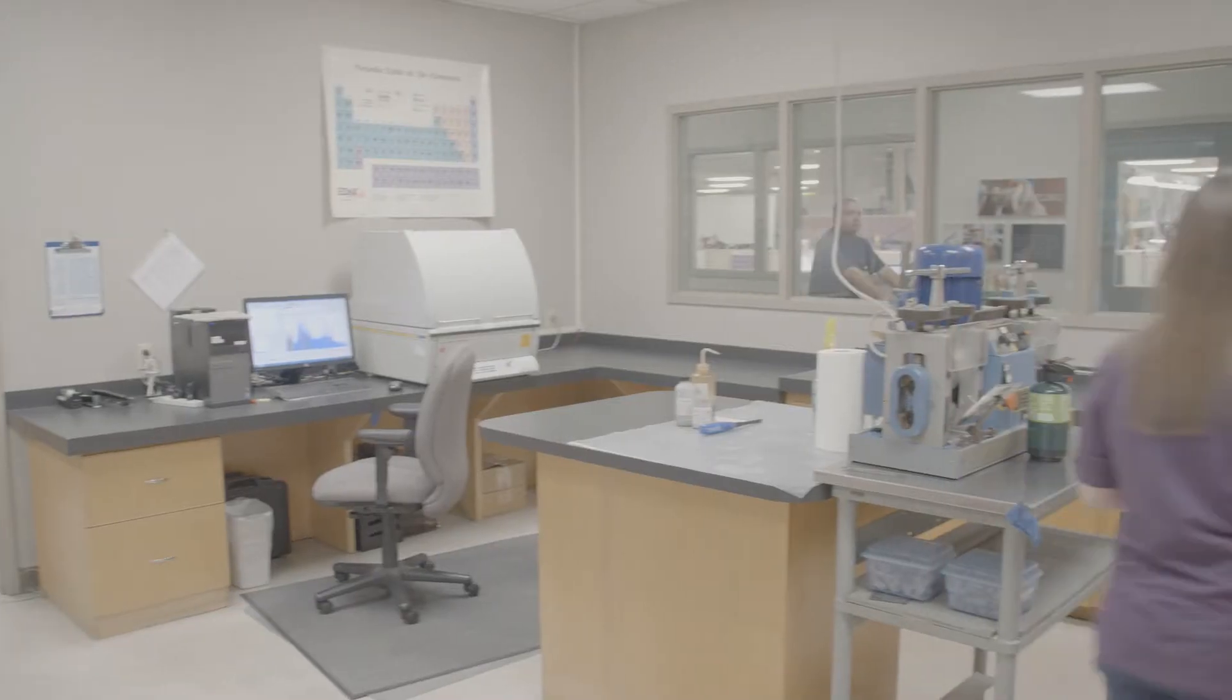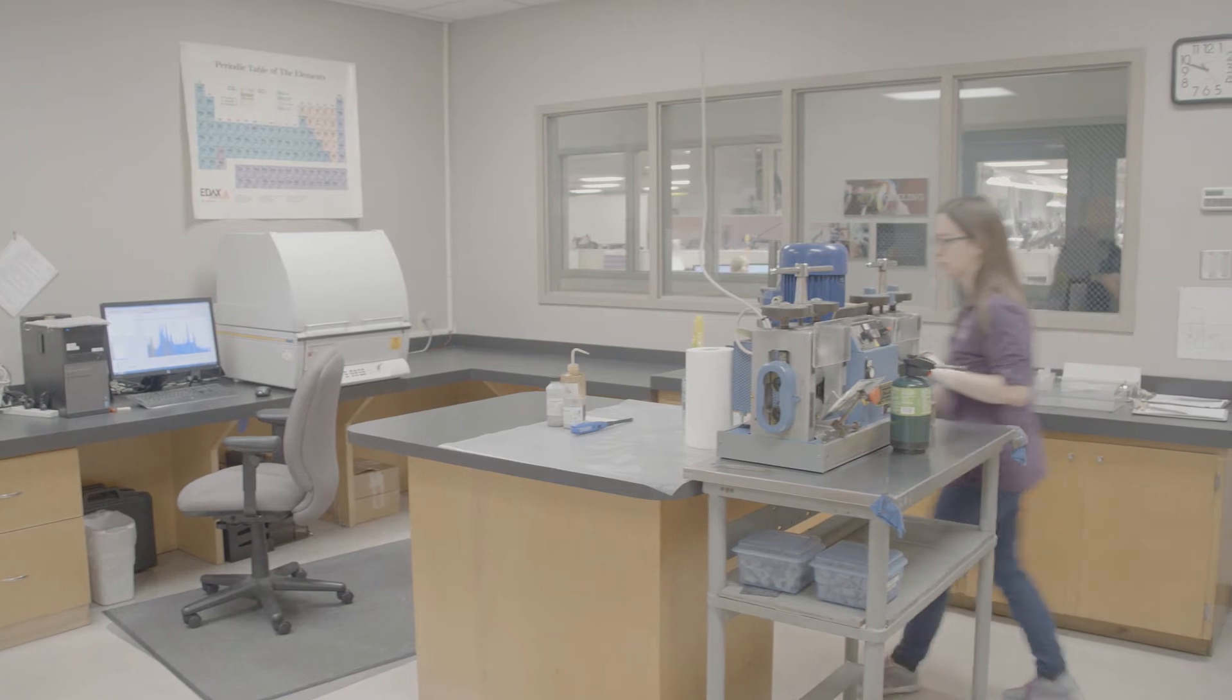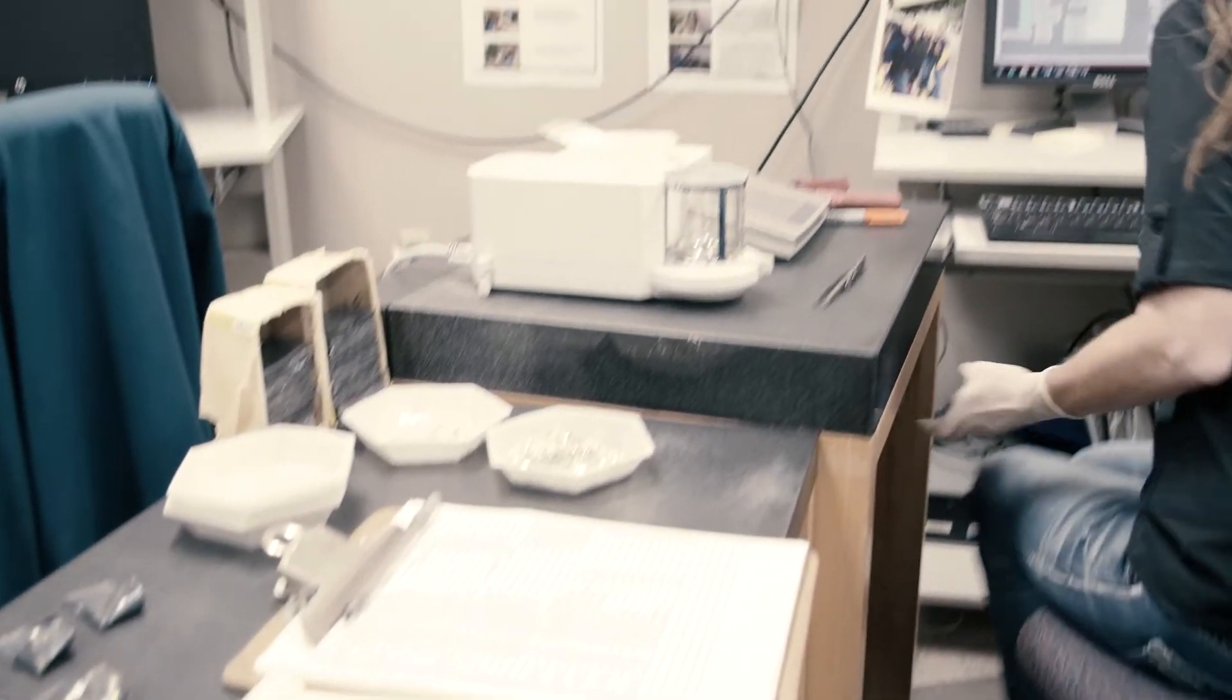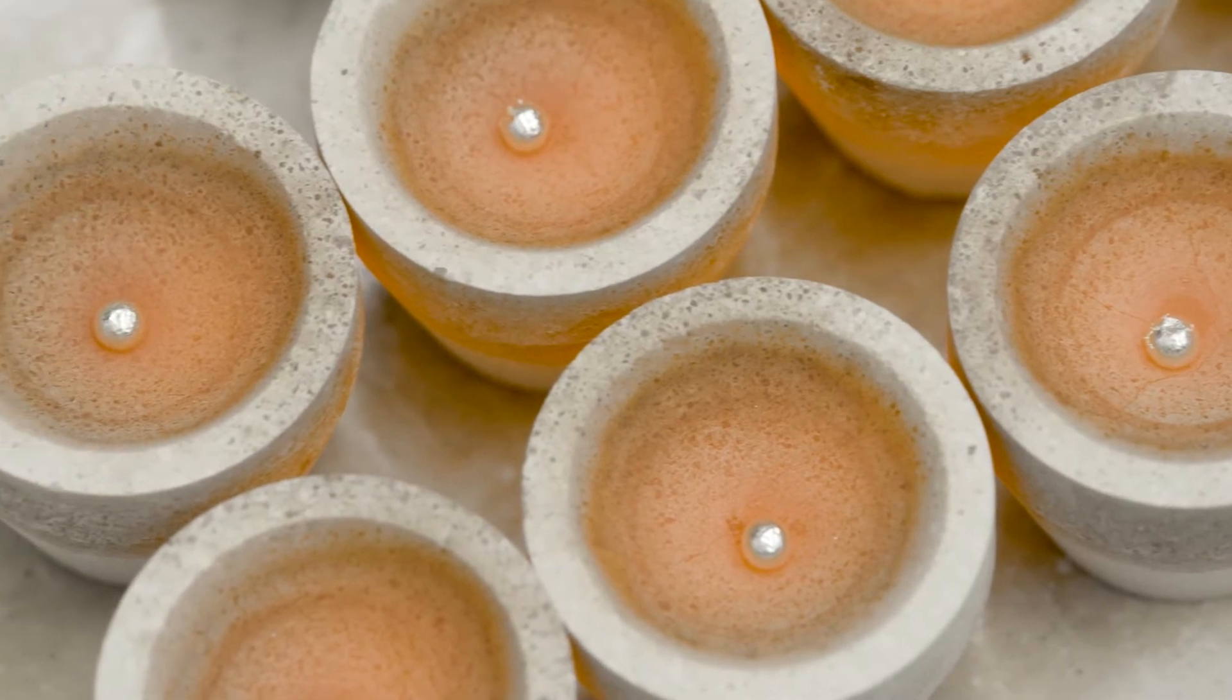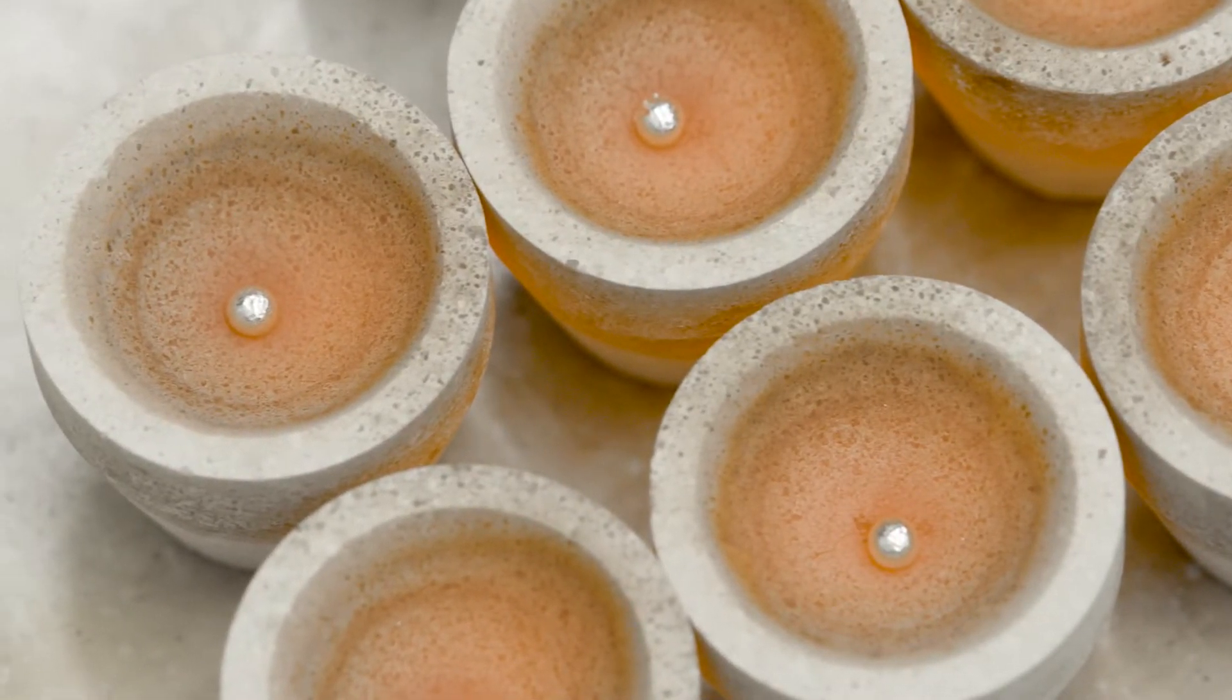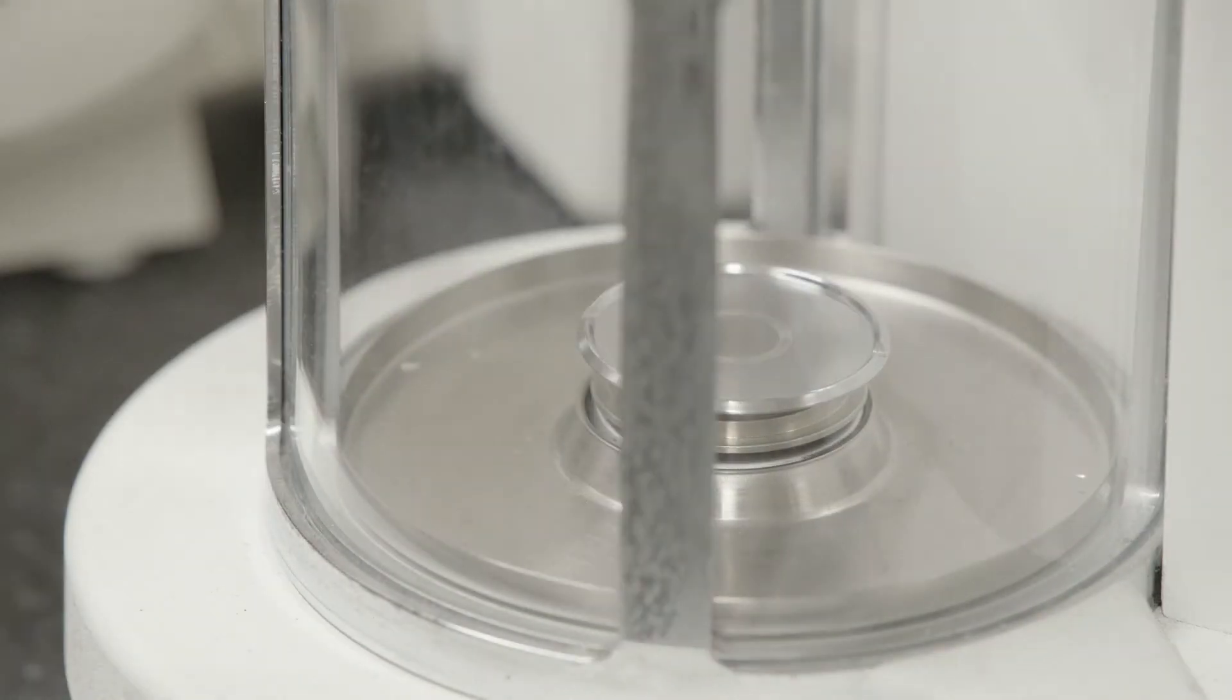Stuller's assay lab technicians ensure our customers receive the highest quality metals every time they buy. With more than 25 years of experience in this specialized lab, technicians test the precise elemental content of gold and other metals created in our metals fabrication department.